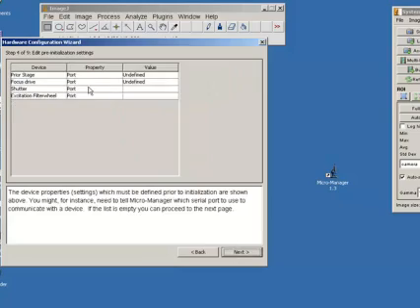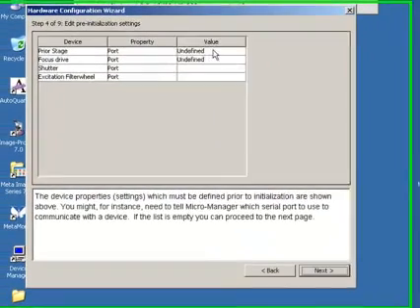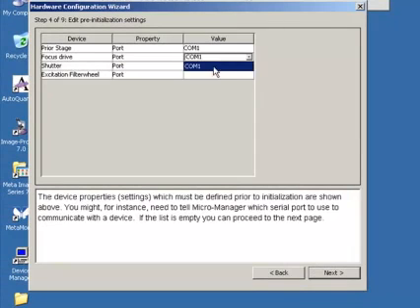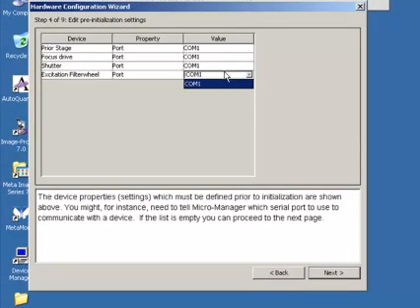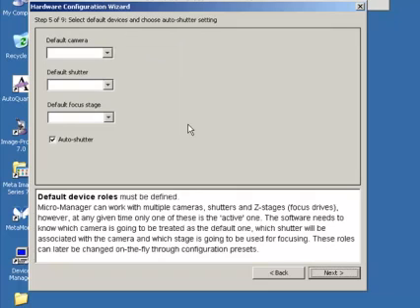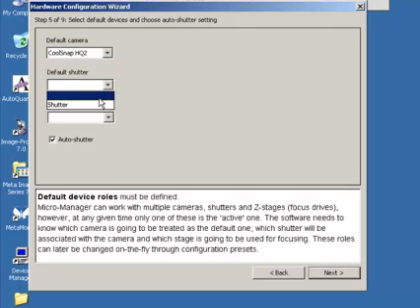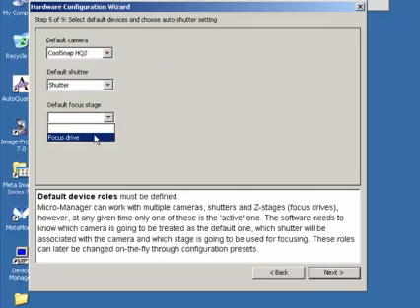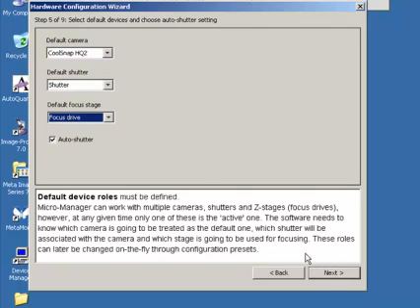So, if I click next. Then, first thing we need to do is tell it which COM port all of the various different components are on. So, I said it's just the ProScan controller and it's plugged into COM1. So, let's set all of these to COM1. And next. And it's just talked and spun the filter wheel. So, it's talked into that properly. Then, that's our default camera, our default shutter and the focus drive.